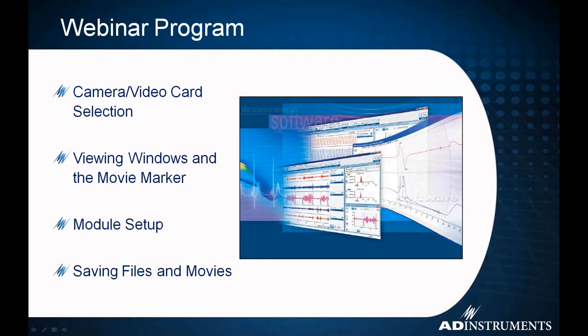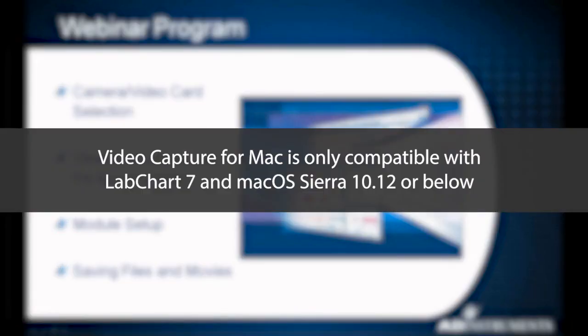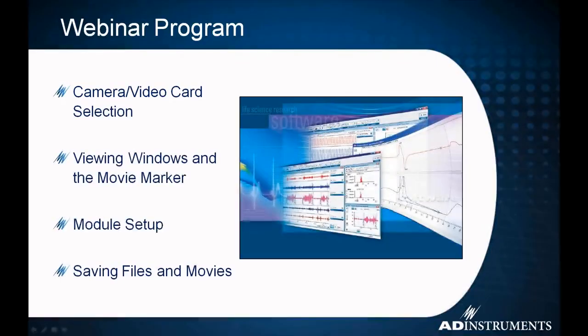So now that we've covered all that basic boilerplate at the beginning, we'll talk about what the webinar program is going to consist of today. First, and this is a very common question, I'm going to cover camera and video card selection for using both with the Macintosh version of Capture as well as the Windows version of Video Capture. We'll talk about the viewing windows and how the movie marker works in your data. Then we'll move on to actual video capture module setup.